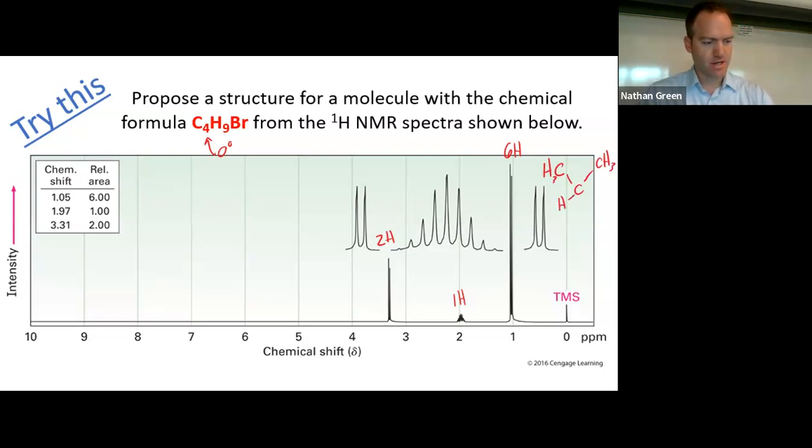I'm assuming Lily correctly identified this as a doublet and said my CH3s better have 1 neighbor. So this whole chunk, Lily got that entire piece from just this. Now we had to make some leaps mentally to get here, but this is why proton NMR is so useful. From this one signal that integrates to 6H, we drew all those atoms in.